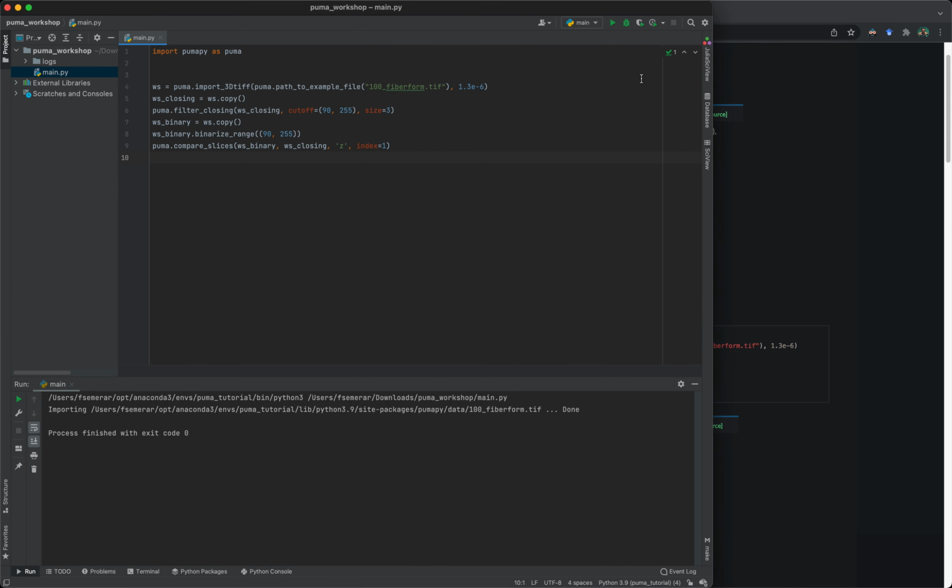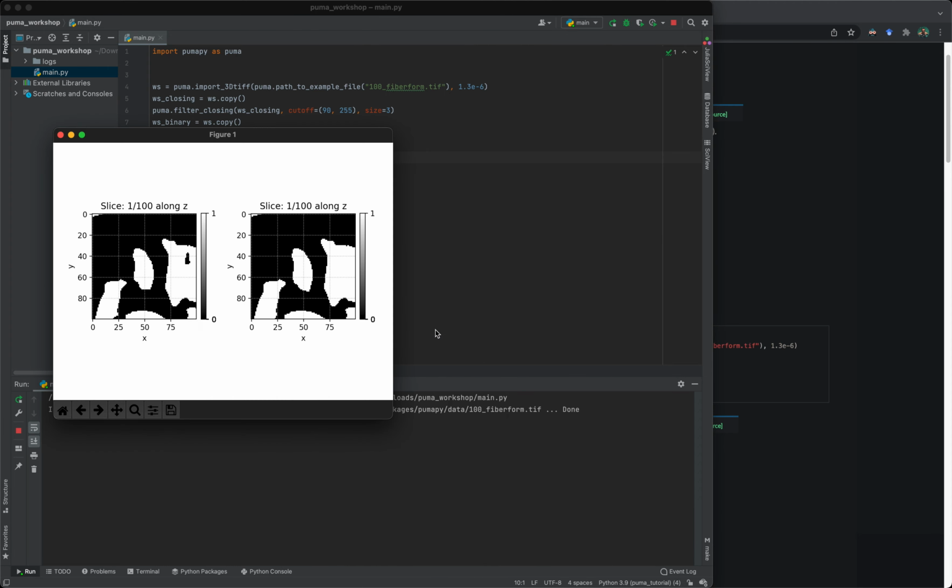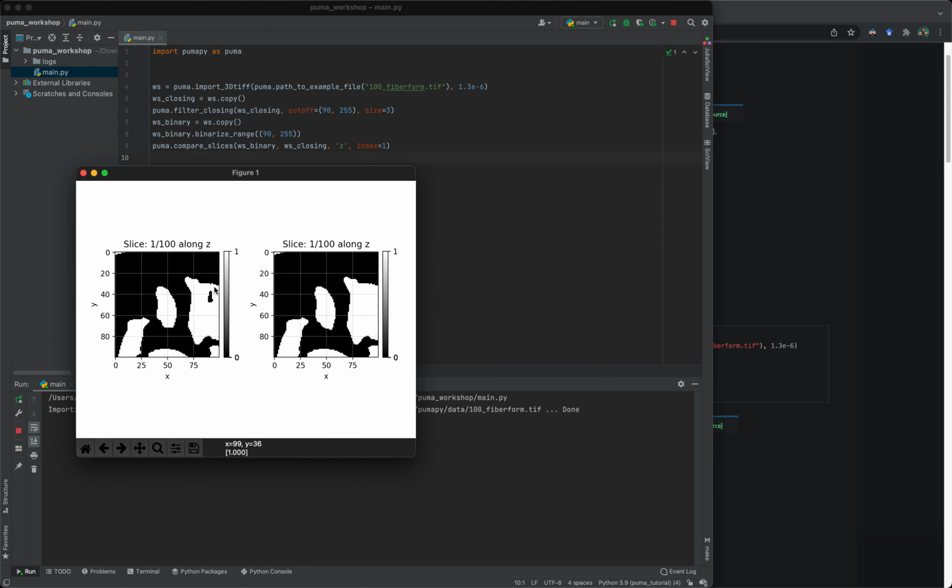In that case, it's not going to put it inside the side view, but it's going to open up a window as you will see. And now if you just scroll using the wheel, then it's going to scroll through the material, and in this case I'm just showing that on the left we have our original image, and on the right is the filtered one. The filter specifically is called closing, which basically closes the gaps, but it's not important, it's just an example.